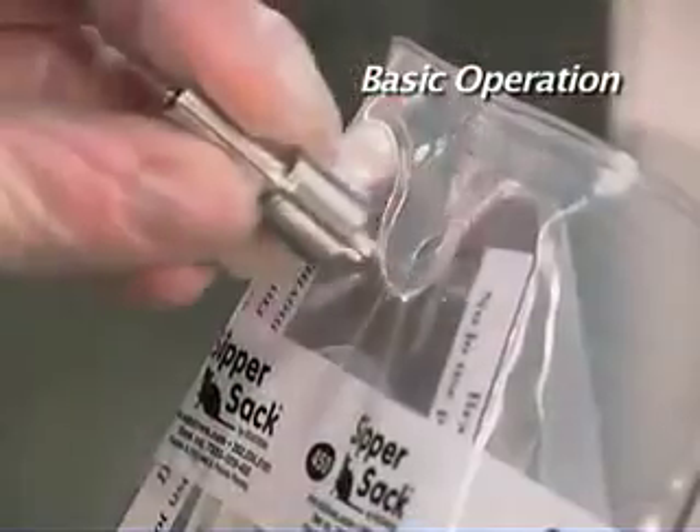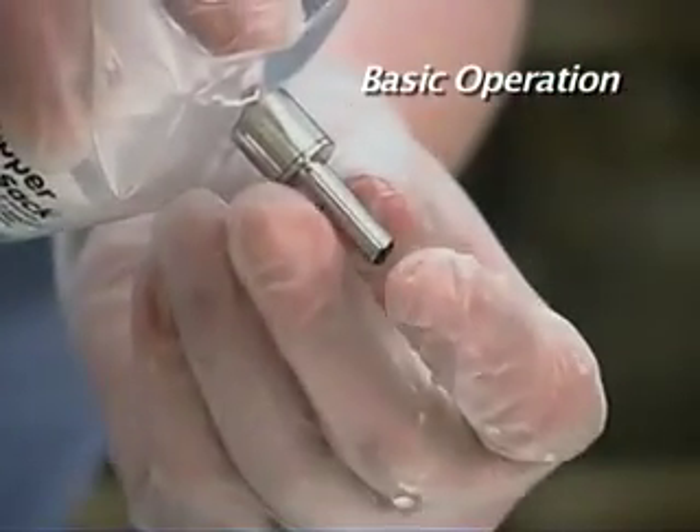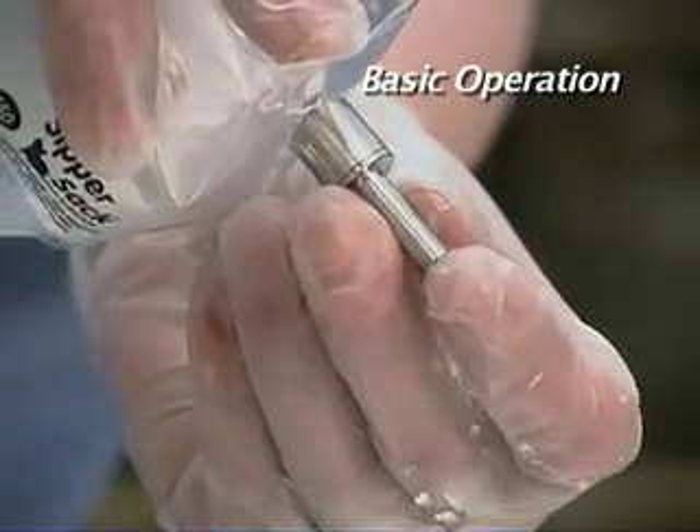With the Sippersack now full, insert the reusable autoclavable drinking valve in the fill port. Remove the Sippersack from the filler and prime the valve by toggling the valve stem.